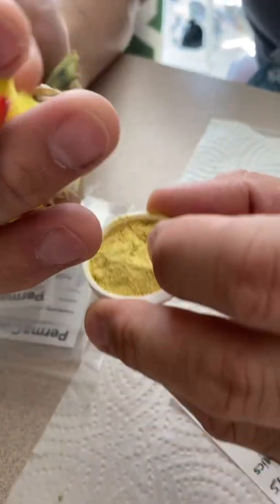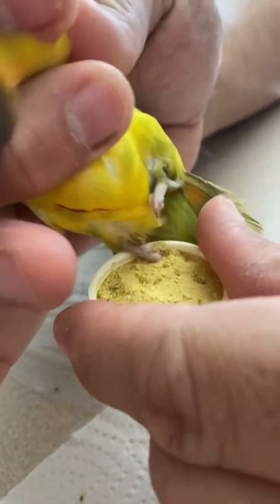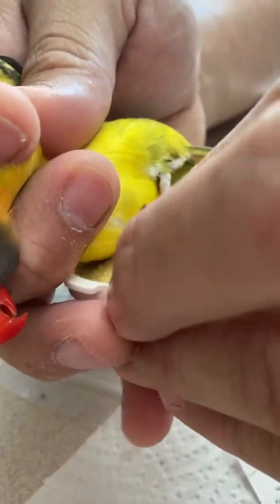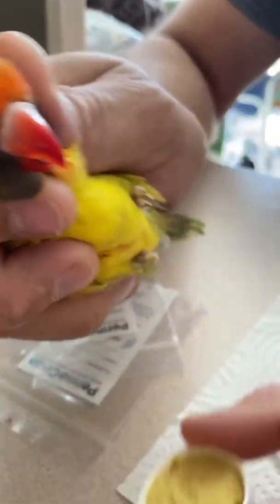It is extremely important to clot the blood as soon as you get the blood that you need for the card. This is the part that scares a lot of customers. Parrots are extremely sensitive, and if they lose just enough blood, they can go into shock. So this definitely has to be a quick process — you have to know what you're doing to get just the right amount of blood out and then stop the blood immediately.